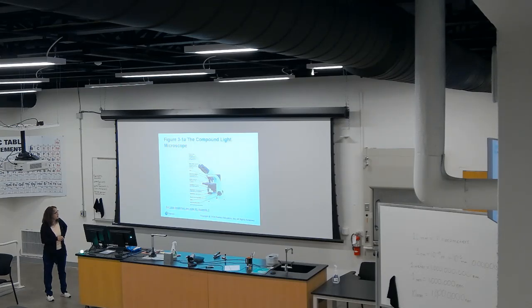And then here is the arm of the microscope. This is the base, and in the base we have the light source or illuminator. We typically also have the light switch, and then we have 2 knobs, the fine focus knob and the coarse focus knob. And then in the front of the arm we have the stage that holds the slide in position.